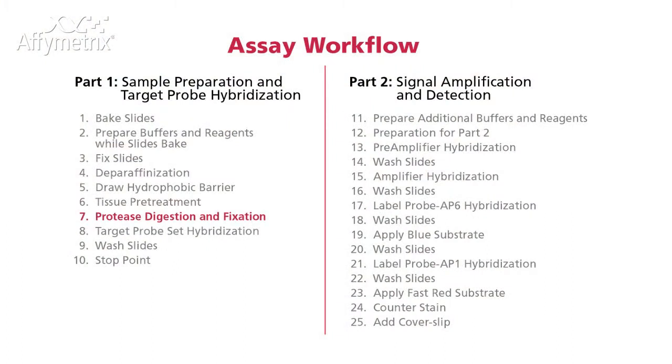The same technique can be used for protease digestion, target probe, preamp, amp, and label probe hybridization, and applying FAS-Red substrate.